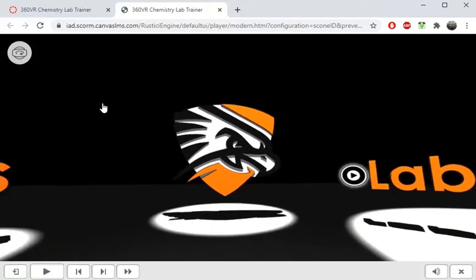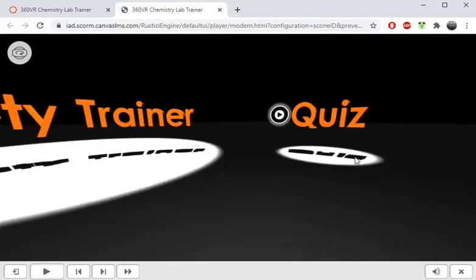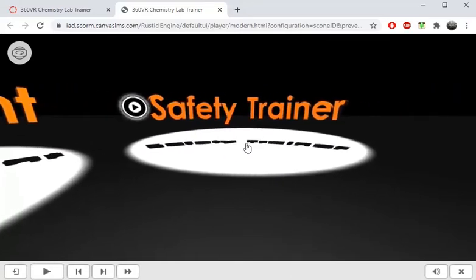It was rather interesting working on this type of menu because outside of the gaming industry, there aren't a whole lot of applications for 3D menus. This menu started as a 3D model I created in 3D Studio Max. I intentionally built it without too much distraction so the students will have an easier time navigating. One interesting item of note is that a VR headset does not care what I have set to be the initial position. However, because it's so easy to look around with the headset on, this isn't a challenge.